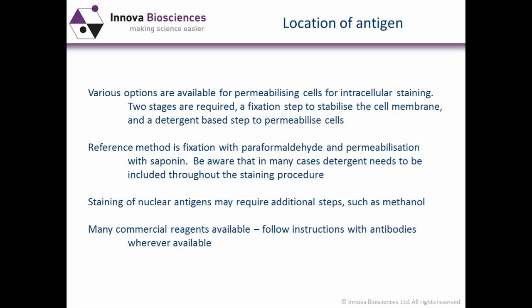If you're using that method, be aware that in many cases the detergent needs to be included throughout the staining procedure. Therefore, if you're undertaking, for instance, an indirect stain, you need to keep saponin in your wash buffers to ensure that, effectively, the holes in the cell membrane are maintained throughout.